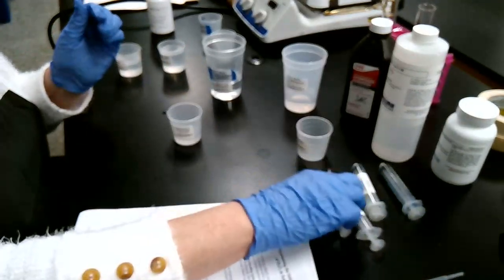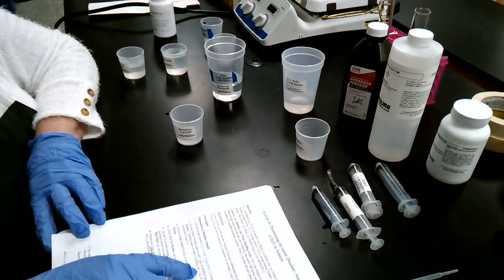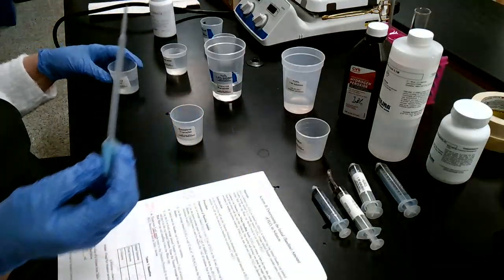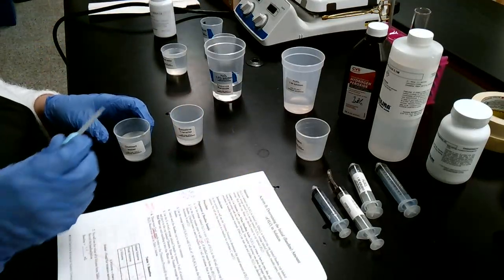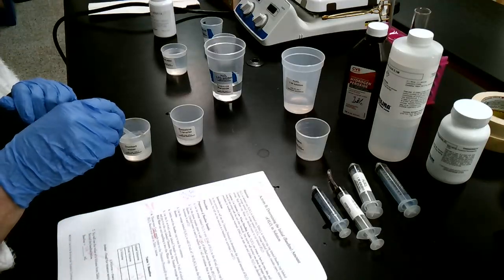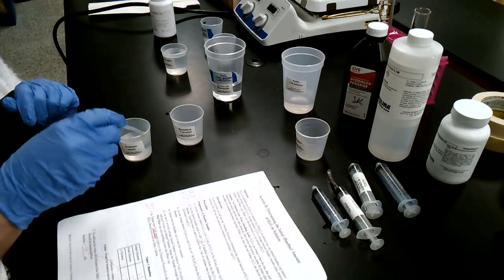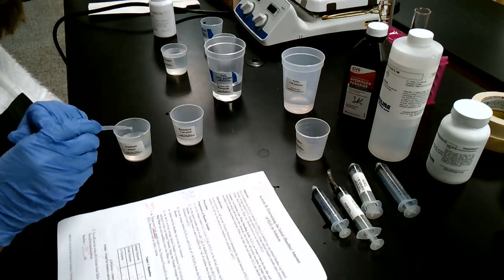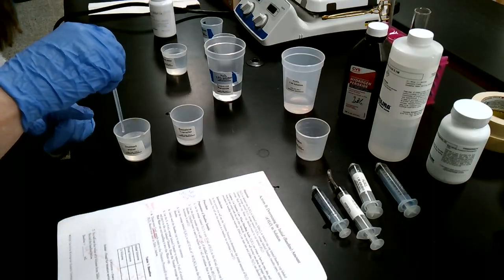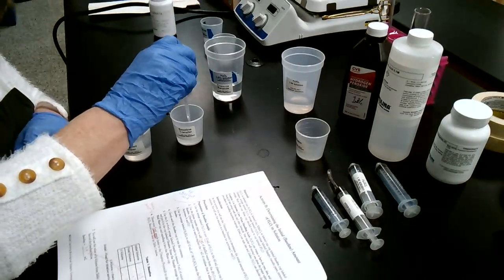That's hydrogen peroxide. Now the next step says that I'm going to add 1 milliliter of distilled water. So I'm going to take my distilled water, and I have a cup full of distilled water here. I'm going to measure up, probably beyond, but then squeeze out until I have 1 milliliter. So I squeeze it. Oh, better get a better squeeze in here. Squeeze it all the way up, and so it's more. So I'm going to squeeze out until that comes down to the 1 milliliter mark. There's 1 milliliter, and I'm going to squirt that in.